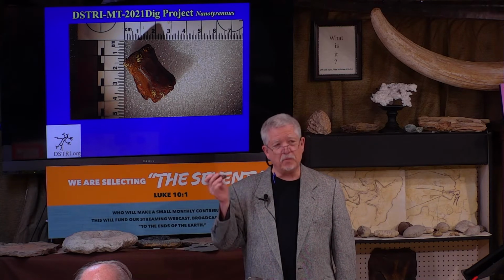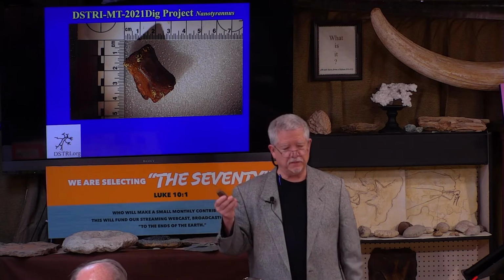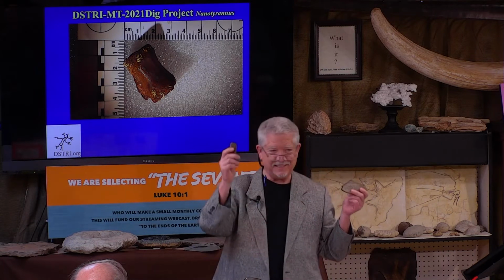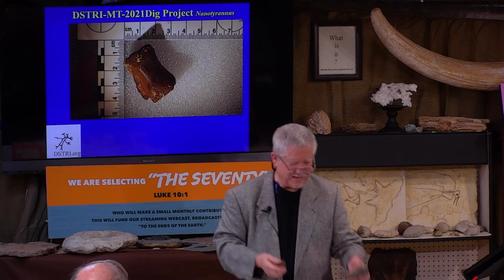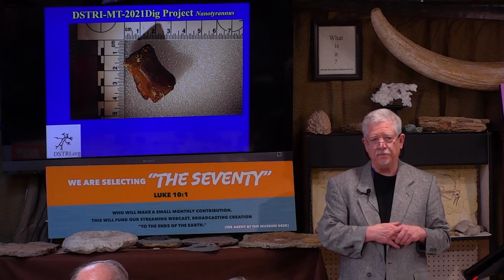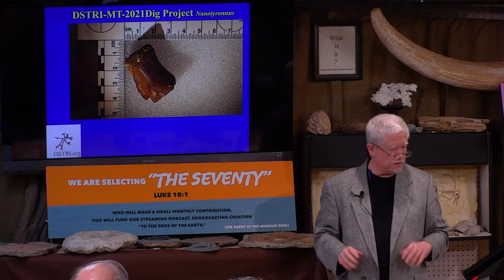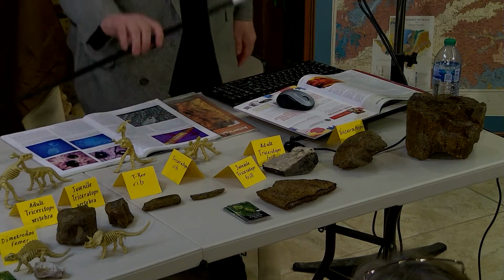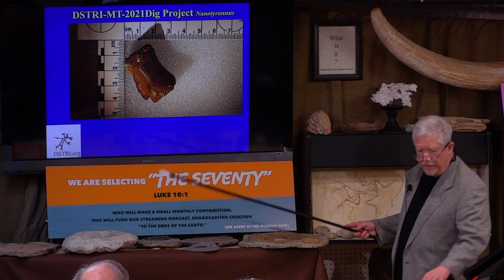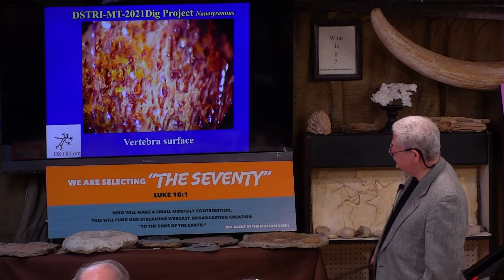The numbers of permineralized specimens that we come up with are mostly rare. It's this that is common. So most people are under the mistaken impression that these are rock, and they're not rock. We're using standard protocols to dissolve them. So when I dissolved this a little bit, I put it in decal for just a couple of days just to see what would happen.